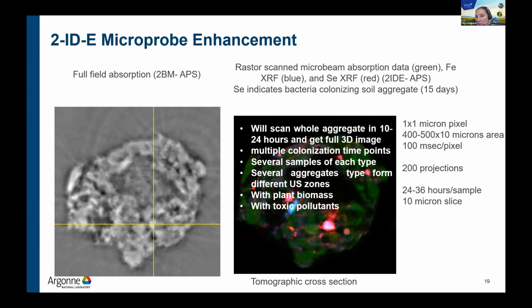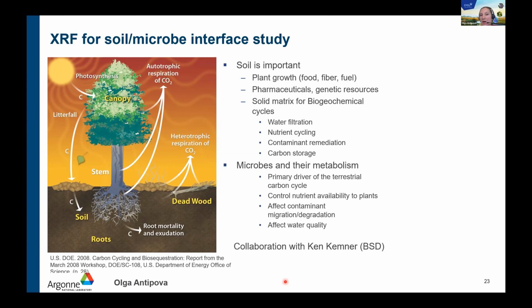Now I'm going to describe a few science cases out of the many we have. I'm going to start with the larger samples and go to the higher resolution imaging. One of the projects I want to describe is one I have worked on with Ken Kemner for many years now. We work with imaging soil aggregates. Soil is an important medium for supporting plant growth and important for nutrient cycling and so on. It's a very interesting subject to study and kind of difficult due to its opacity.